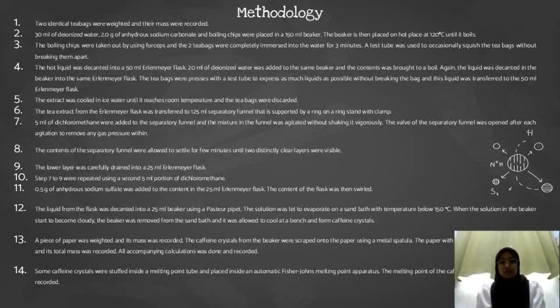After that, the boiling chips were taken out using forceps, and the two tea bags were completely immersed in the water for 3 minutes. After that, a test tube was used to squeeze the tea bags without breaking them. Next, the hot liquid was decanted into a 50 ml Erlenmeyer flask, and then 20 ml of deionized water was added to the same beaker and the contents were brought to boil again.